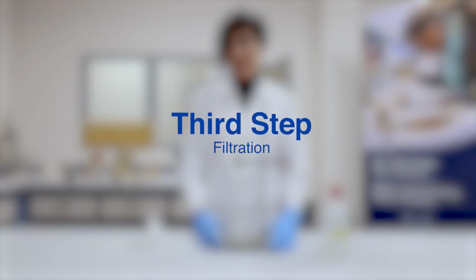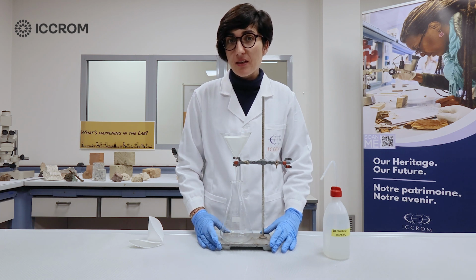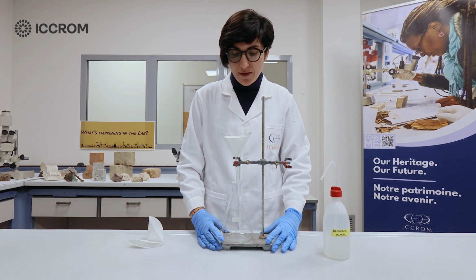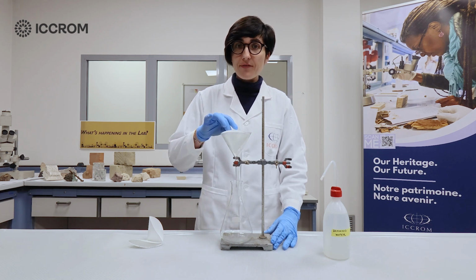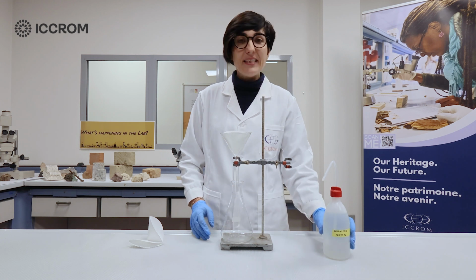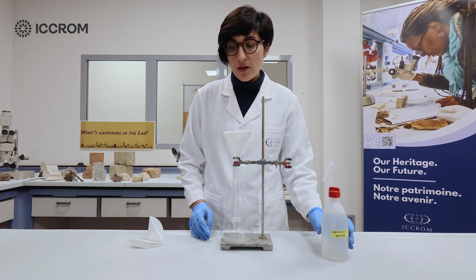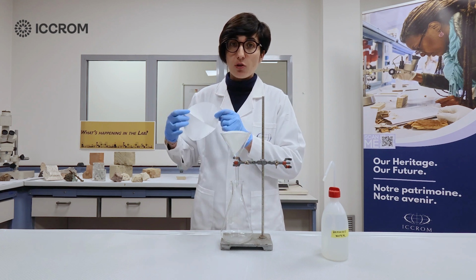While we wait for the acid digestion to be completed, we're going to start getting set up for the next step of the test, the filtration. For the filtration, you're going to need a glass funnel, your folded filter paper, a glass flask, funnel stand, and indeed the deionized water.